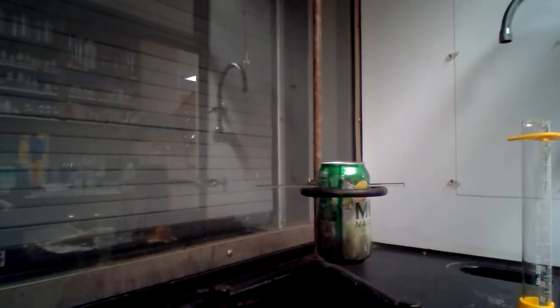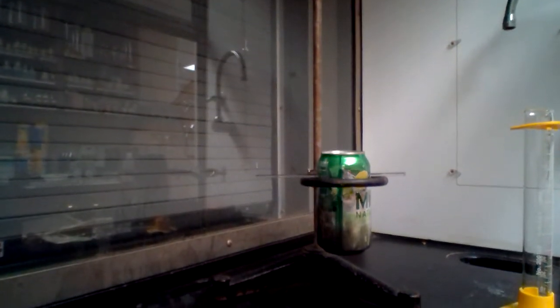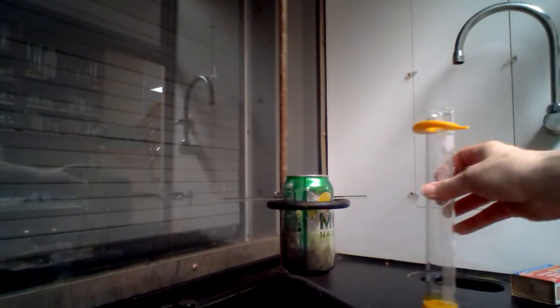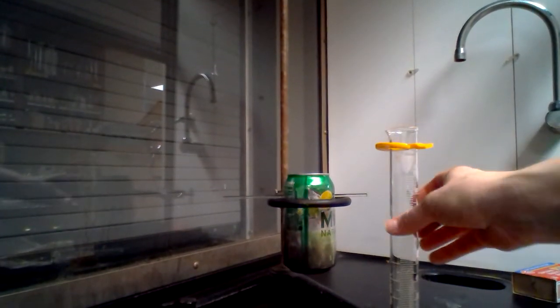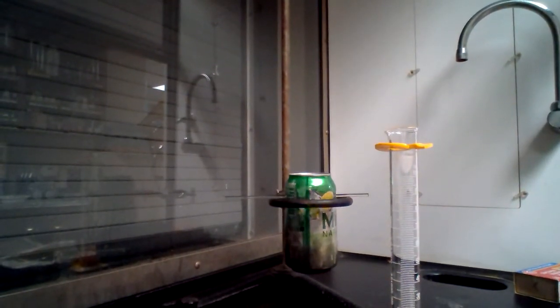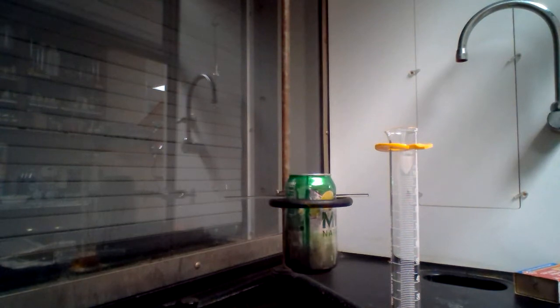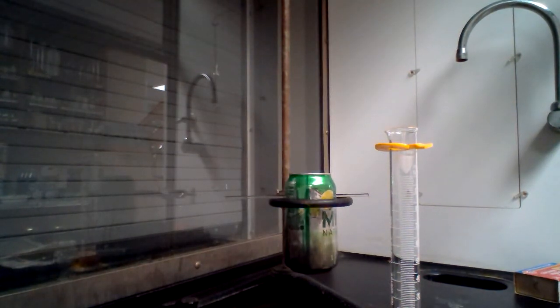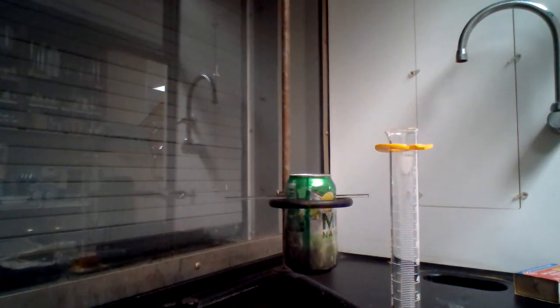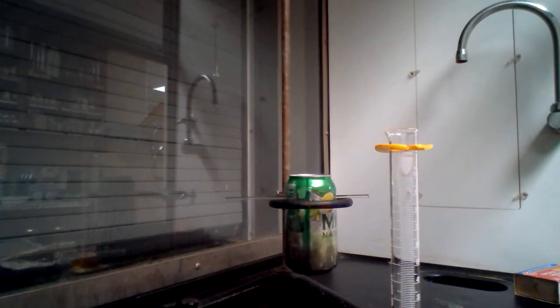What you're going to need to perform the lab is measure out between 100 and 150 milliliters of water. You do need to take note of how much water you are using.